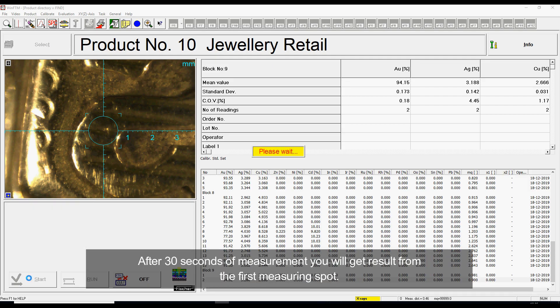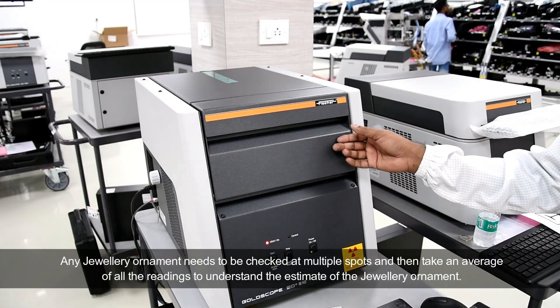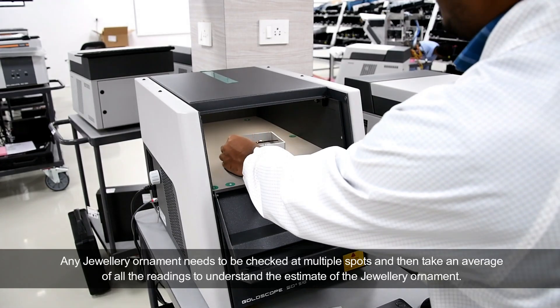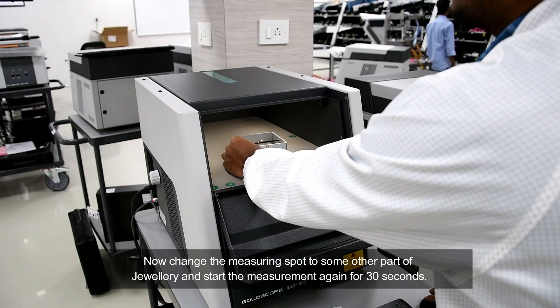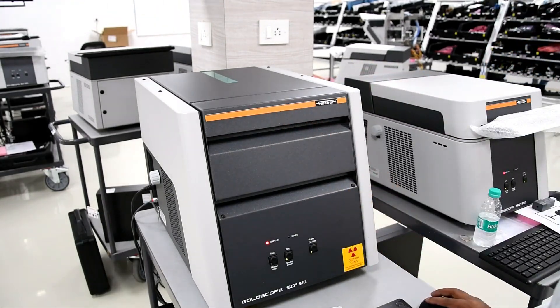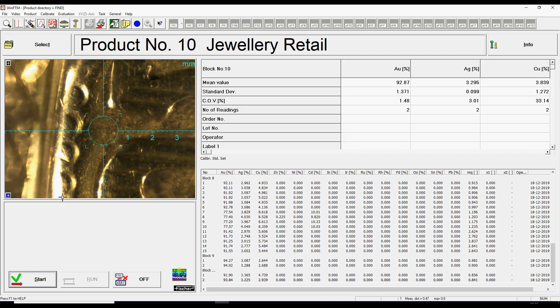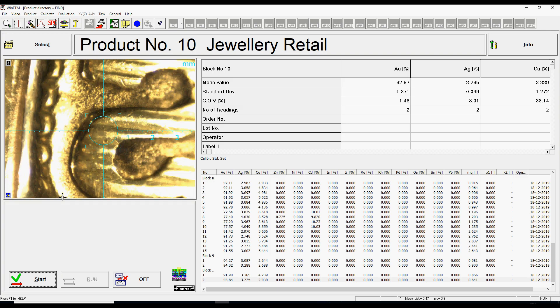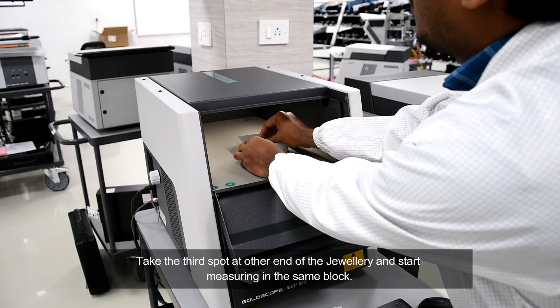After 30 seconds of measurement you will get a result from the first measuring spot. Any jewelry ornament needs to be checked at multiple spots and then take an average of all the readings to understand the estimate of the jewelry ornament. Now change the measuring spot to another part of the jewelry and start the measurement again for 30 seconds. Take the third spot at the other end of the jewelry and start measuring in the same block.